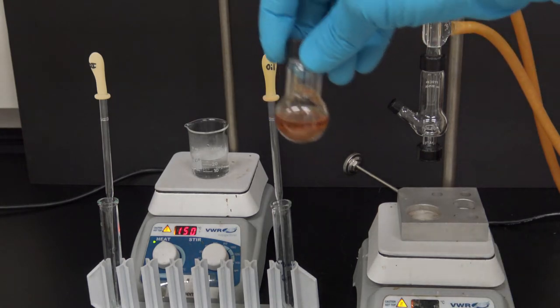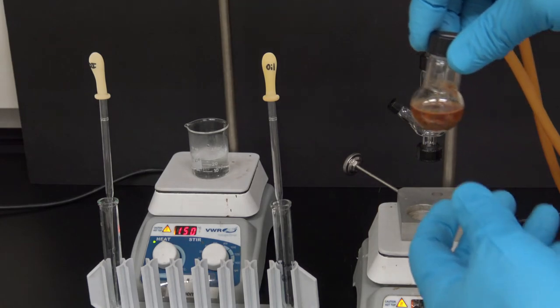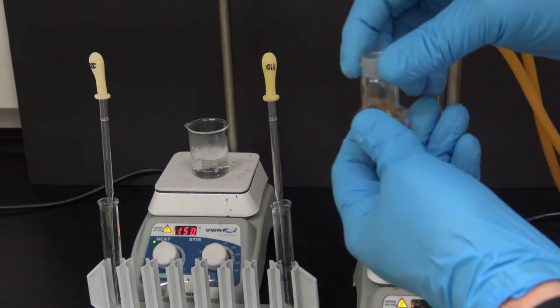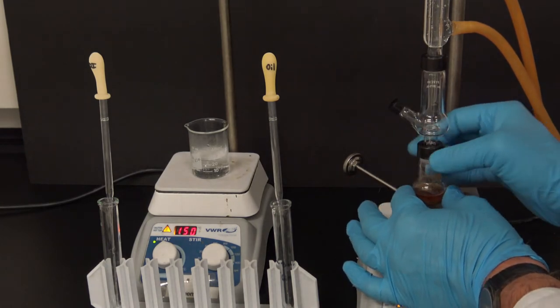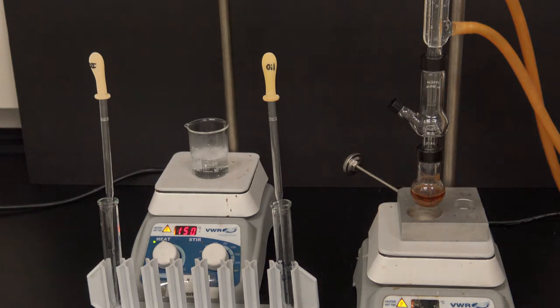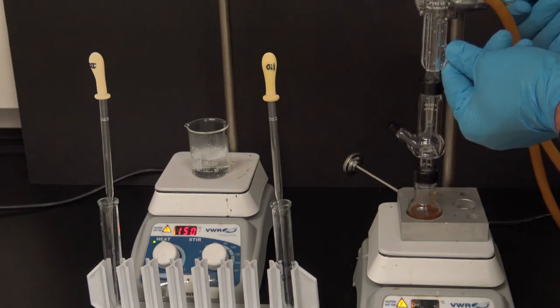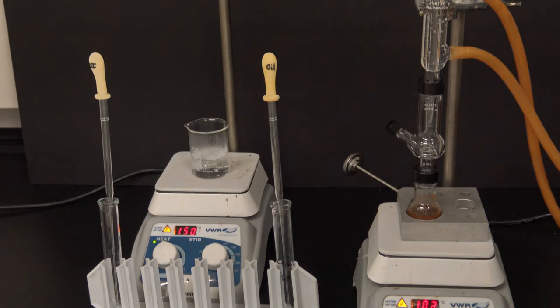I've taken my cloves off my vacuum system there. I've capped them. I'm now going to add to that my stir rod and connect it up to my Hickman still. I'm going to turn the water on to my water jacketed condenser, and then I will lower the whole apparatus down into my heat transfer block and turn up the temperature to approximately 200 degrees C.